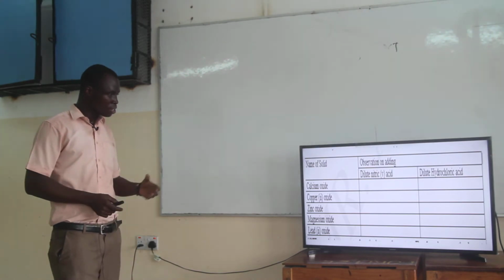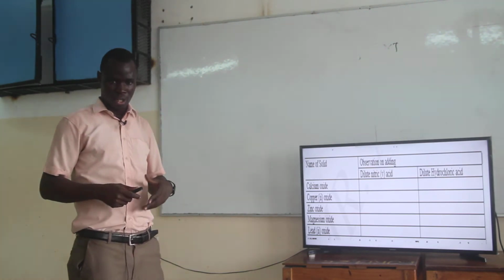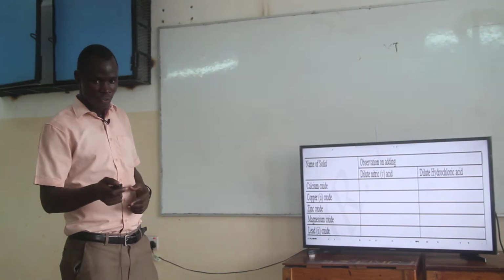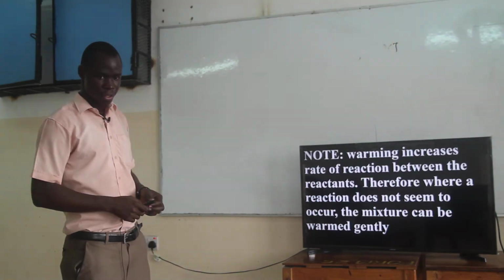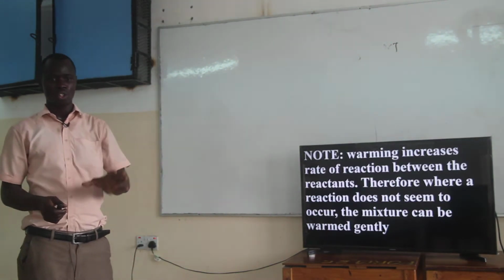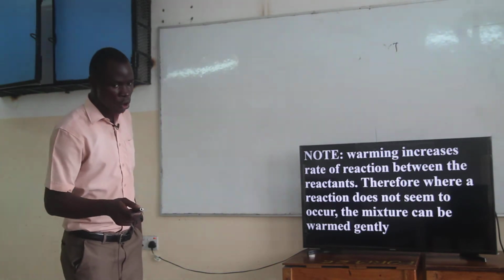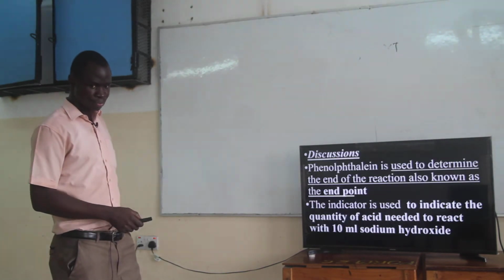Now, some of these experiments might need some warming so as to make the reaction proceed faster. You just warm gently. Warming increases the rate of reaction between the reactants. Therefore, where a reaction does not seem to occur, the mixture can be warmed gently.